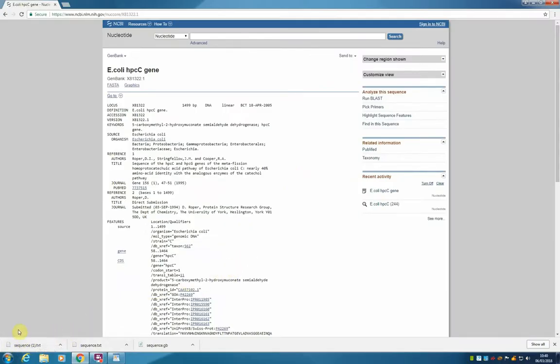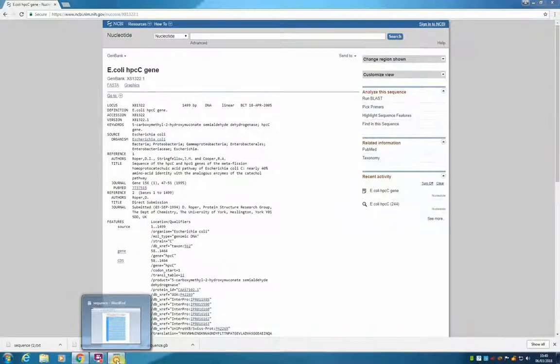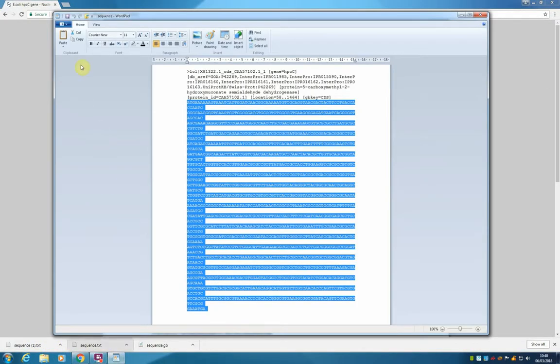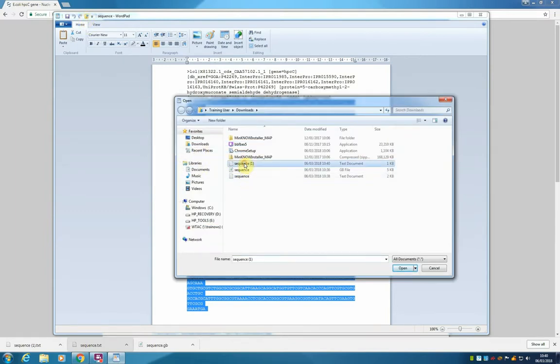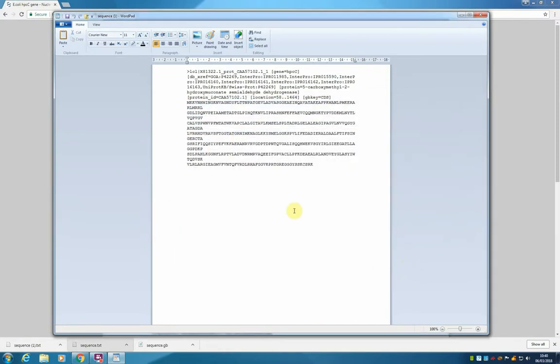This downloads as well as a sequence. This is our third file that we downloaded. We can open it again in WordPad. And this is our protein sequence.